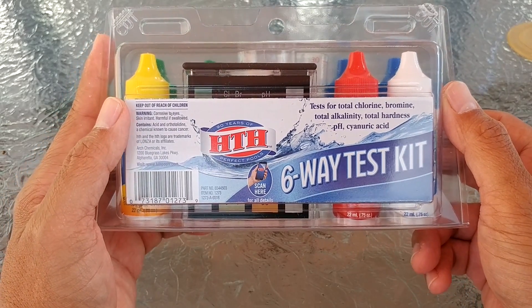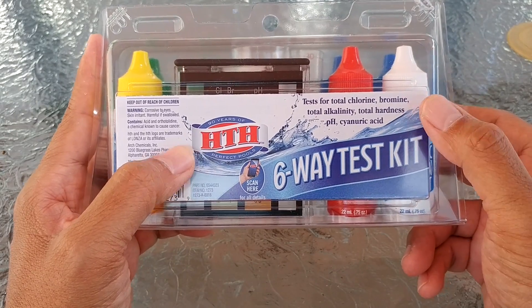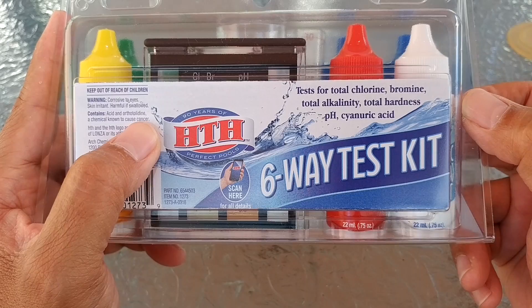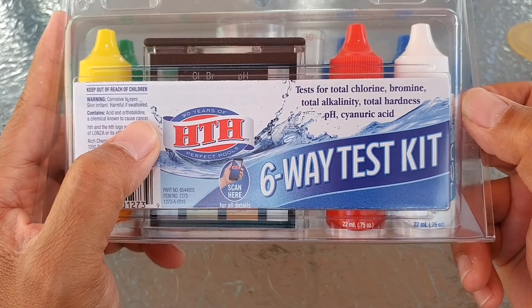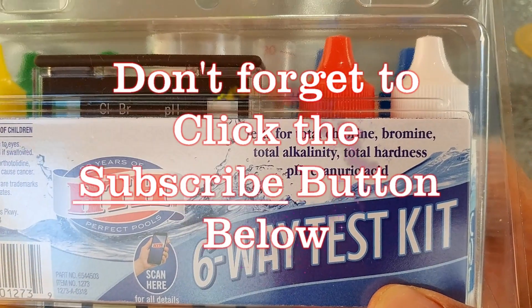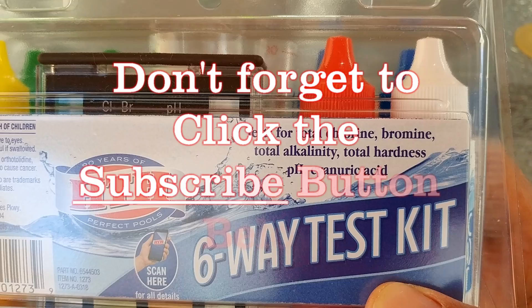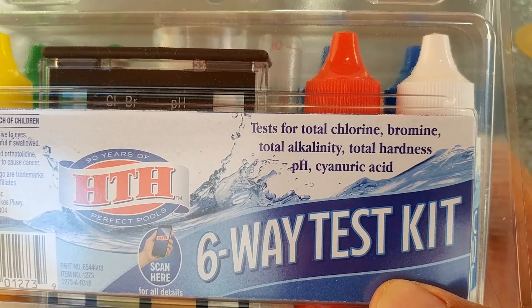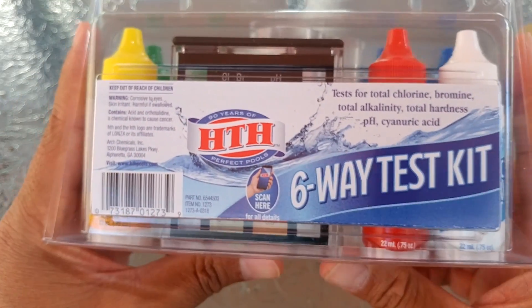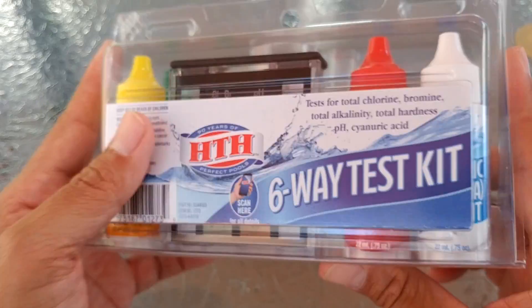For this video we are going to do a quick review of the HTH six-way test kit. This is going to test your total chlorine, bromine, total alkalinity, total hardness, pH, and cyanuric acid. It will actually test the total chlorine or bromine, so this is actually a five-way test kit, but the reason I want this is because it's the cheapest I've found that will also test for cyanuric acid.